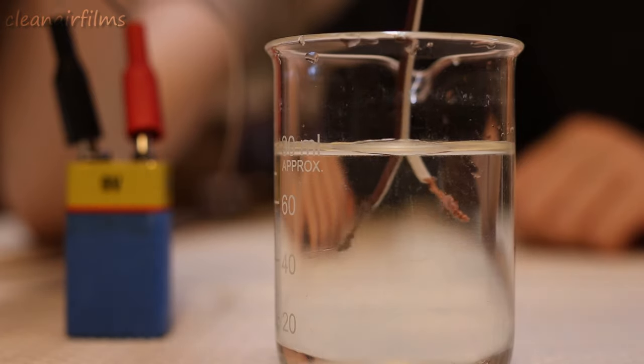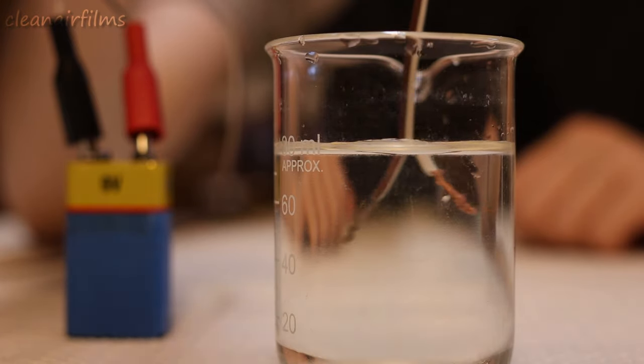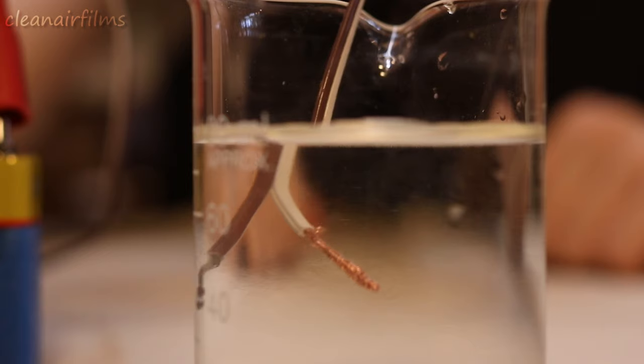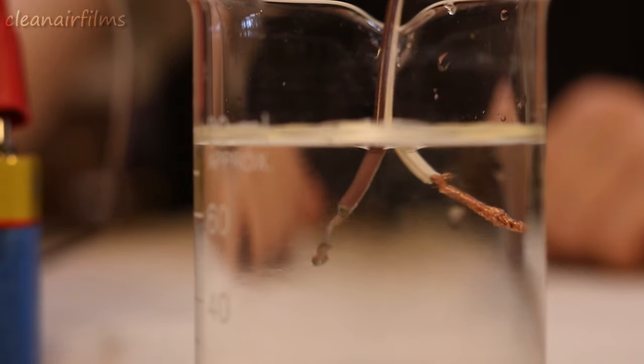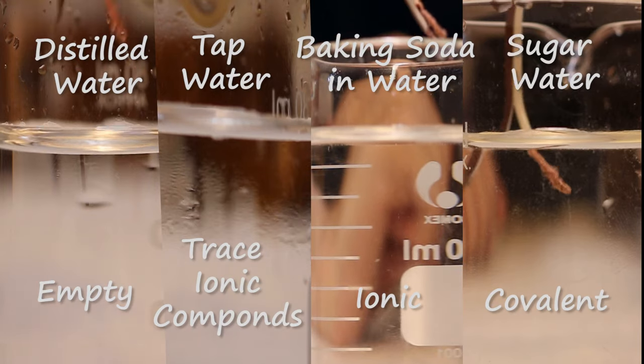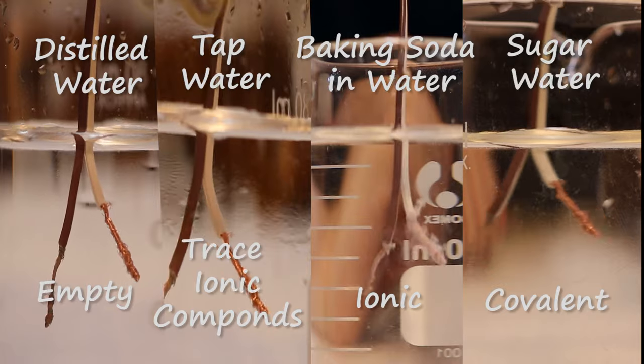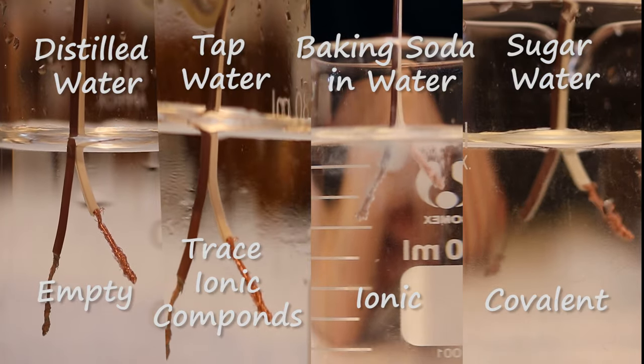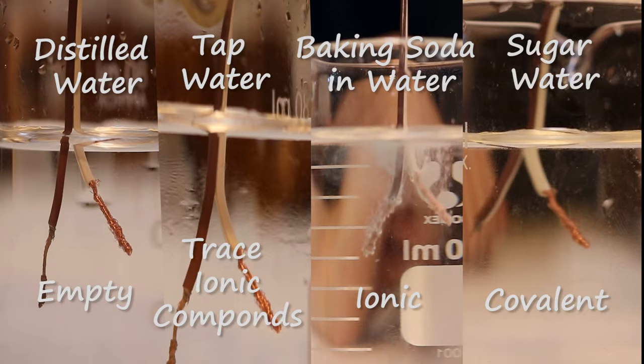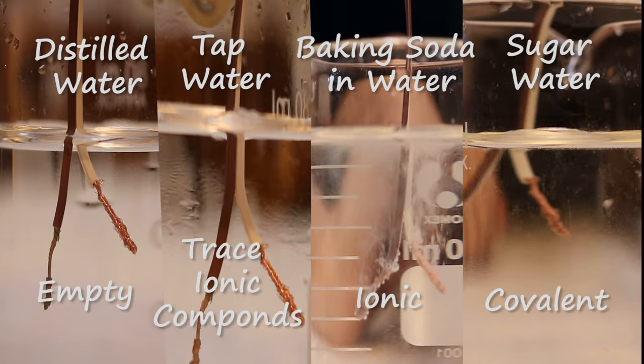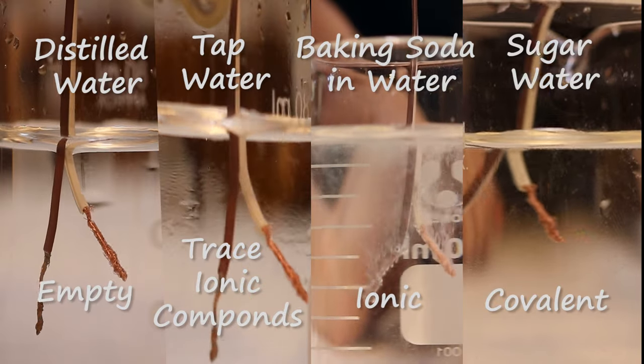In this test with the sugar, no gas bubbles are forming on the end of the wire. This shows that sugar dissolved in water does not conduct electricity. This is because sugar is a covalent compound. Covalent and ionic compounds behave differently when they are dissolved in water. Ionic compounds disassociate into their individual ions. This is what allows water to conduct electricity. The sugar is a covalent compound, which does not disassociate into ions.